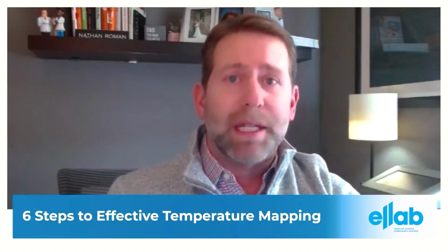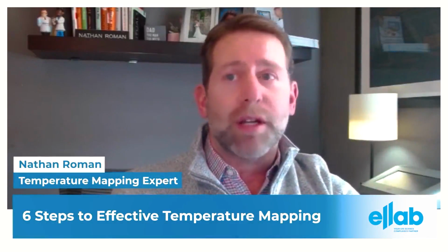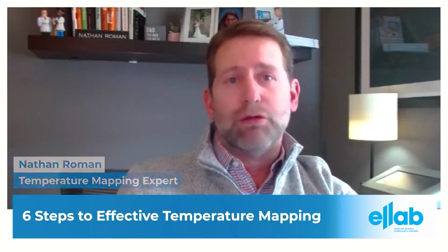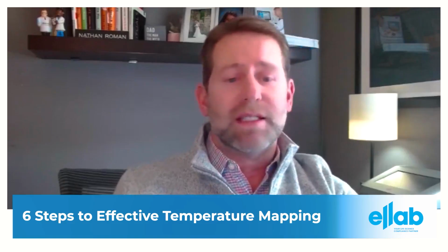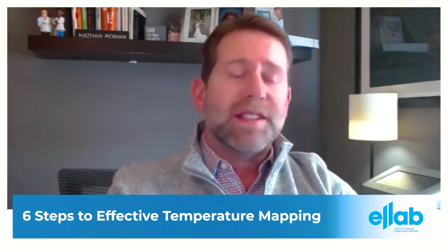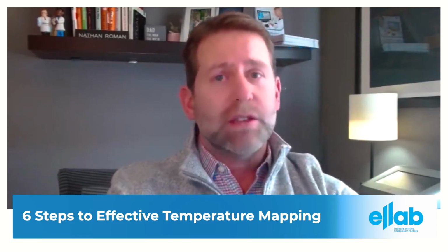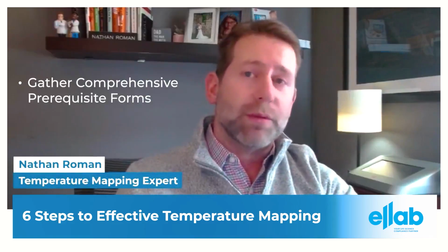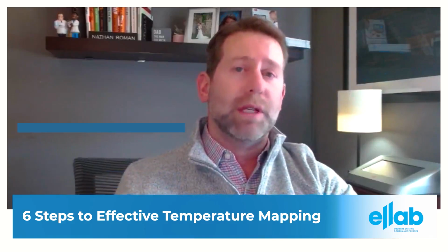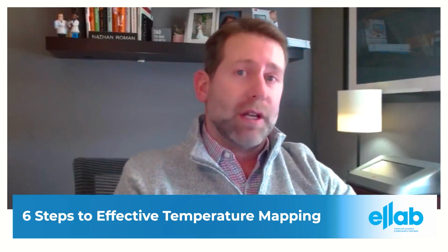Effective temperature mapping begins with understanding its purpose: ensuring product quality, safety, and regulatory compliance. This foundational knowledge sets the stage for success. The 6-step framework acts as a roadmap, guiding you through each critical phase. It starts with gathering comprehensive prerequisite forms, which provide the detailed puzzle pieces about equipment, calibration, and personnel.